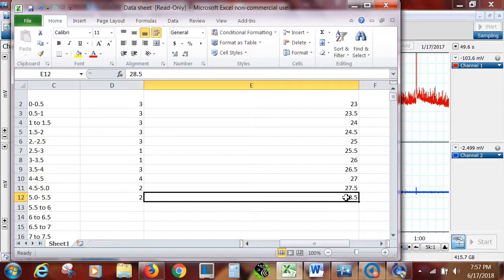Now, how'd that happen? Oh, you see, I would have screwed up that. So really it was to 28, right? What did I do wrong? Did I do something wrong? Could be 0.5, 0.5, 0.5, 0.5, 0.5. So I had a 1, 2, 3, 4, 5.